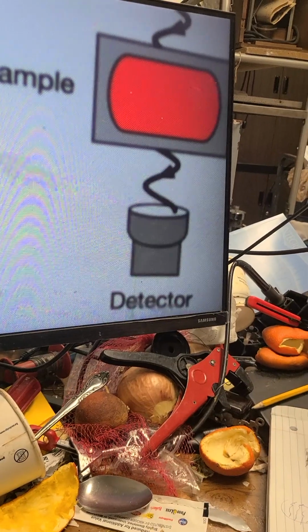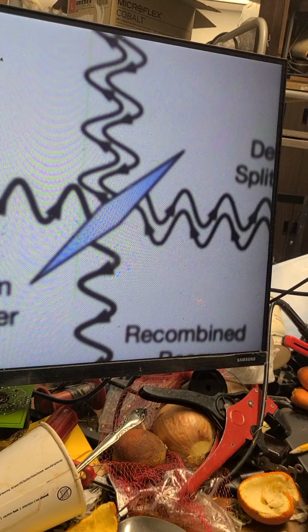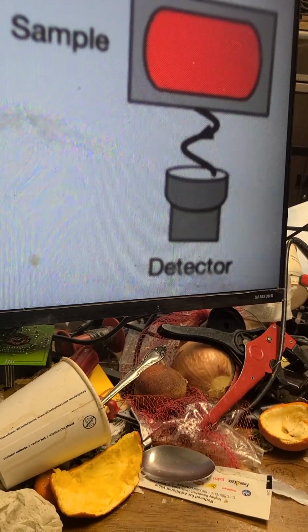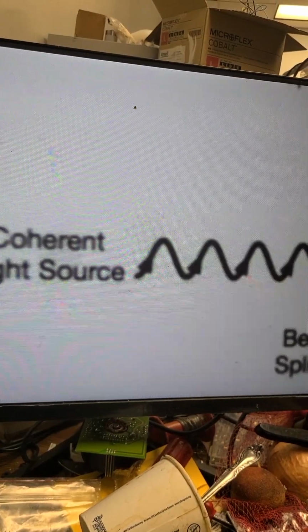And we've just talked about how, even though it's a different actual wave, the frequencies will all constructively and destructively interfere with the same amount of movement. So across the detector, you're going to get all the light from a certain frequency get bright across the entire detector, even though it's from different spots and different actual electromagnetic radiation graph and different phases.